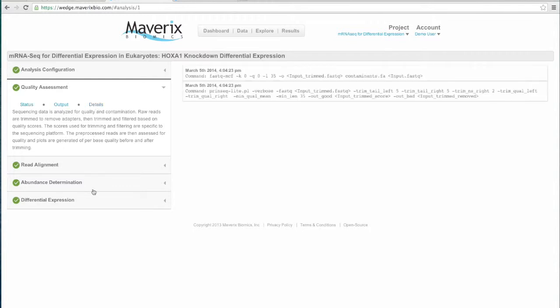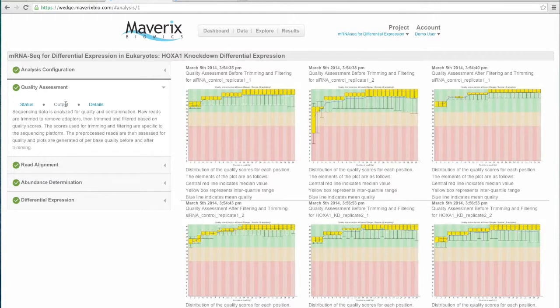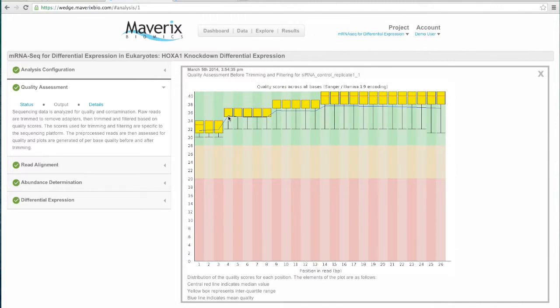If you click Details for any of these steps, you'll actually see the command line, which includes the list of the different bioinformatics tools that were used for that step, as well as some of the parameters that were passed at the command line. Clicking Output, this allows you to see some of the outputs from that step. So for the quality assessment step, what we do is we begin by using FastQC to do a quality assessment of the raw reads. And then based on that, we do some adapter trimming as well as quality filtering. And then we repeat the FastQC so that you have the ability to look at a before and after QA for each of your samples.